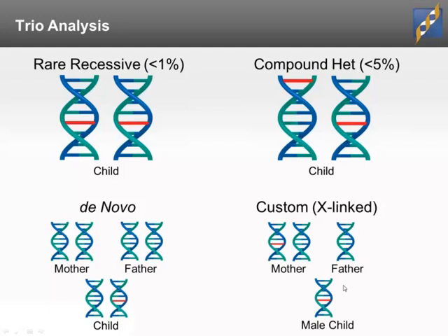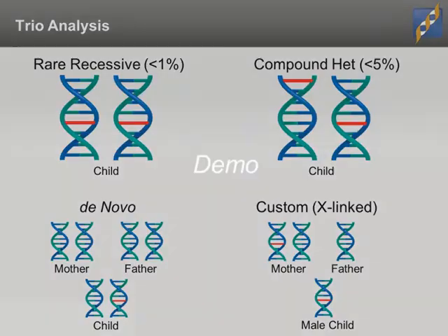However, SVS makes it really easy to identify locations where the father is homozygous reference, the mother is heterozygous, and the child is hemizygous. Please see the X-link tutorial in the October webcast for more information. Now we will move over to SVS to perform these analyses.